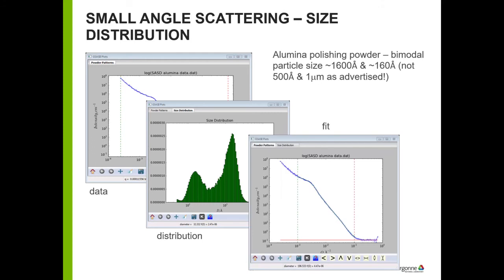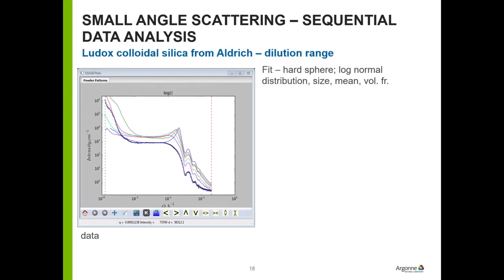And you can then also fit this to a model that has those as parameters. And this, by the way, is fitted. You can't see it, but there is a calculated curve that's under there, and there's a background. And I don't show the difference. Okay. And if you have multiple small angle scattering data sets, you can do a sequence of fits.